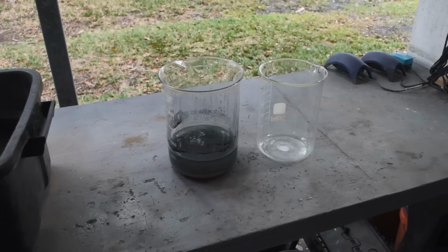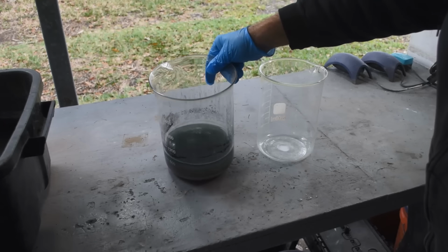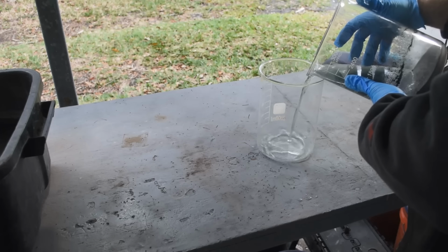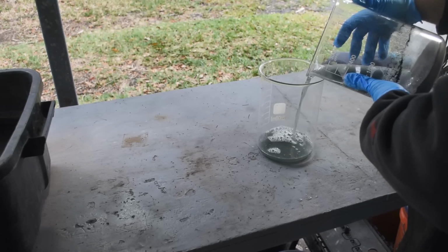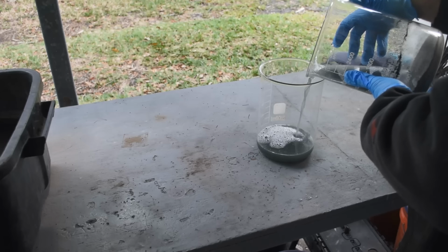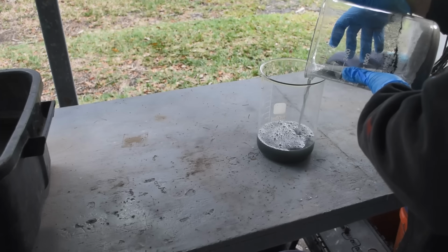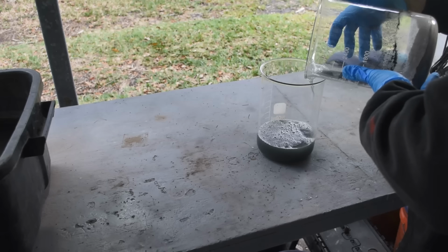All right, it's the next morning. I'm going to decant off this now much greener liquid. Probably a lot of iron making that green. And I'm going to put this stuff back in the fume hood, and I'm going to give it another quick boil in hydrochloric acid just to try and get as much of the base metals out of this stuff as possible.